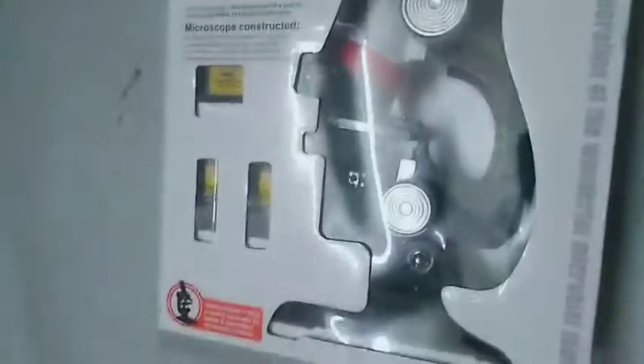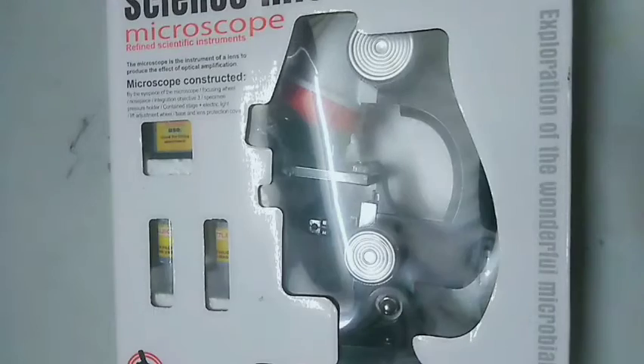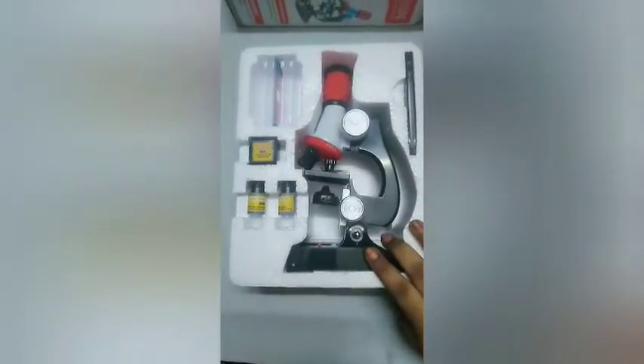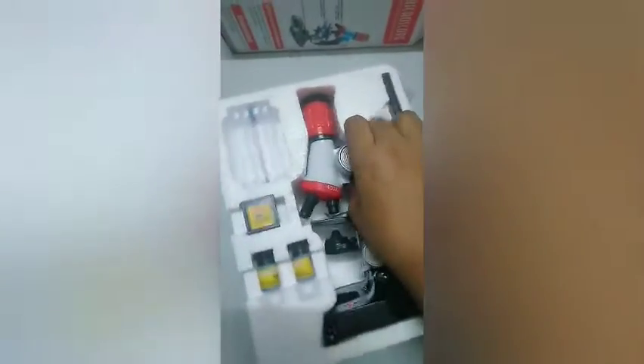You can see what is inside. First I cut it open. So this is our microscope and it is very lightweight.